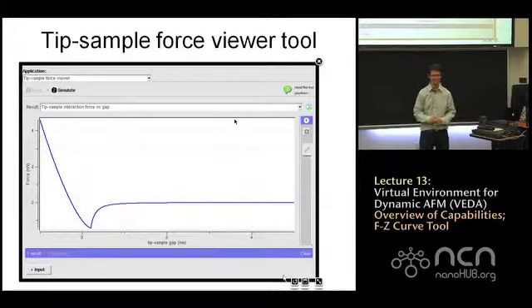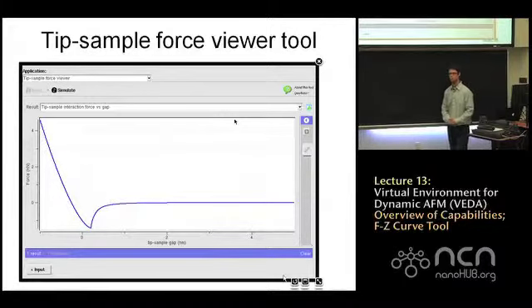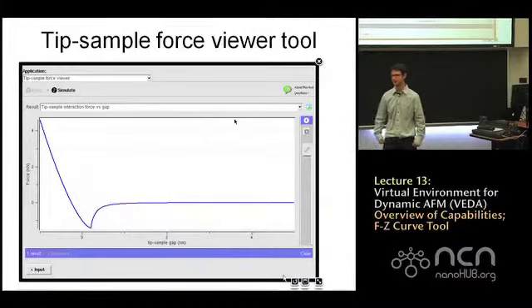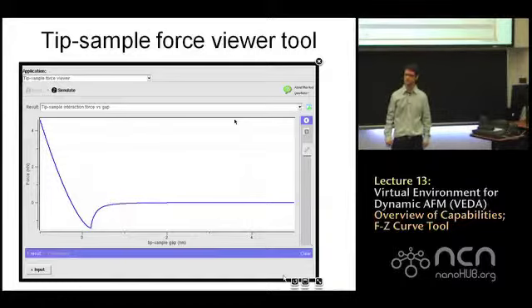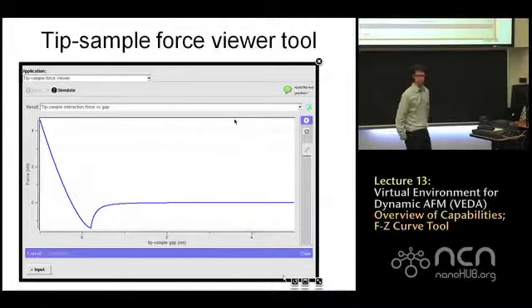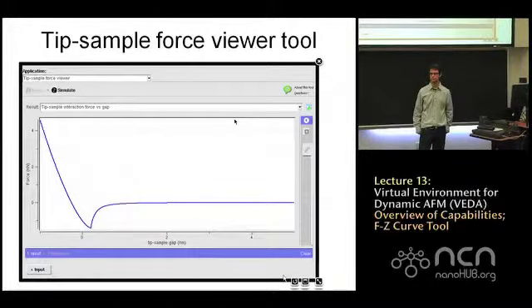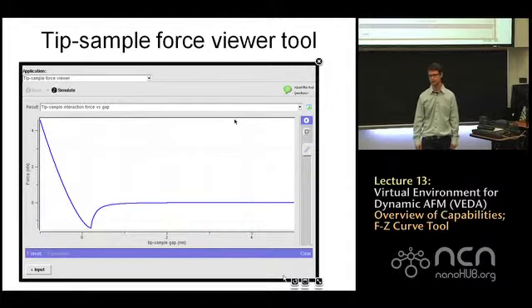An influx of nanoHUB users. The influx is going to be slower. Okay. So there's no little clock that tells. For this one should be really fast because we're not actually crunching an ODE here. So when I run this thing, I always get these blank screens, and I don't know whether it's computing. Yeah. There it is. Okay. I think maybe it's either connection or the web browser. Yeah, there's no little clock that gives you feedback that it's actually doing it. Yeah, there should be a progress bar on the other tools, the ones that are doing more intensive calculations. The force distance curve really should take a second or two.